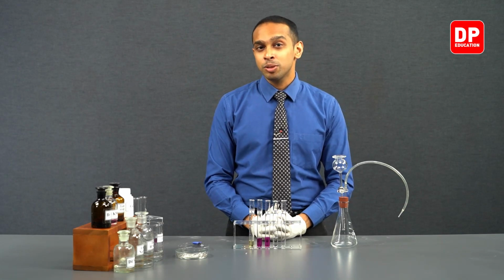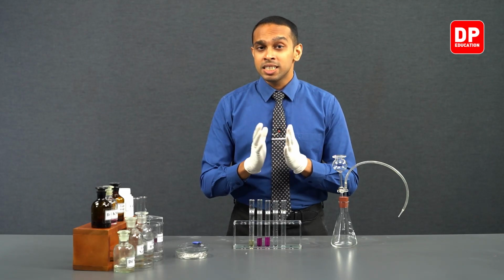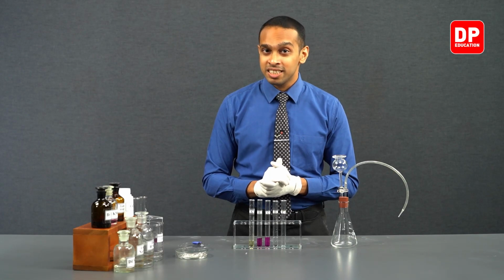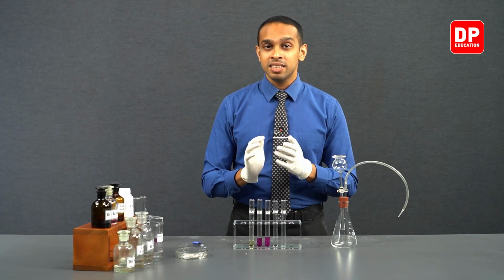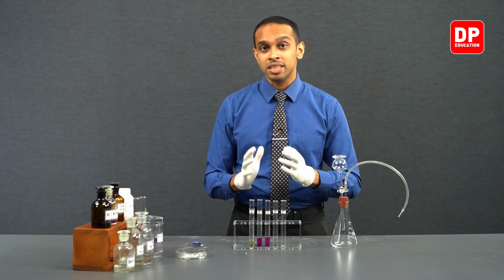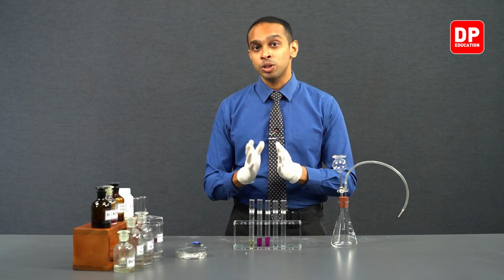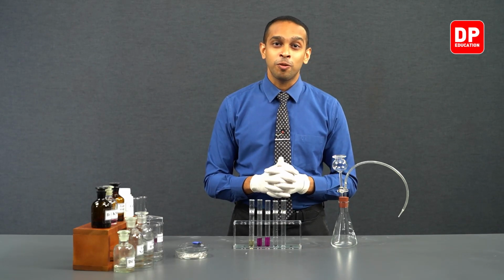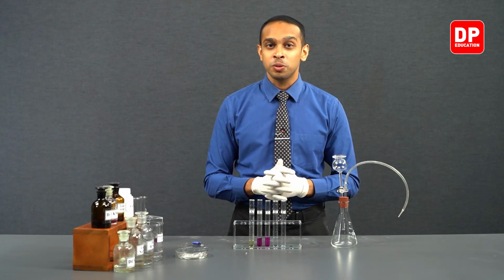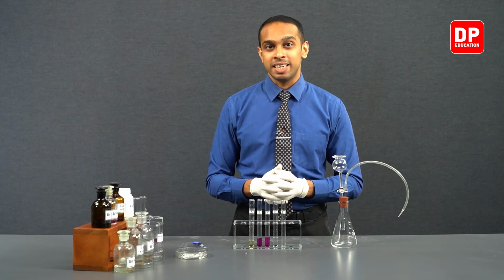However, when it comes to alkynes, if the alkyne contains terminal hydrogens, these terminal hydrogens are going to react with certain cations such as silver 1 plus ions or copper 1 plus ions and form metal acetylides. So these metal acetylides are going to be formed as precipitates.